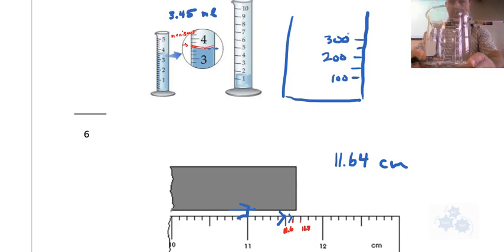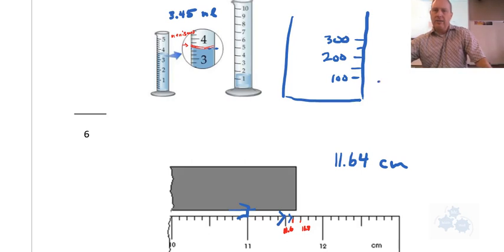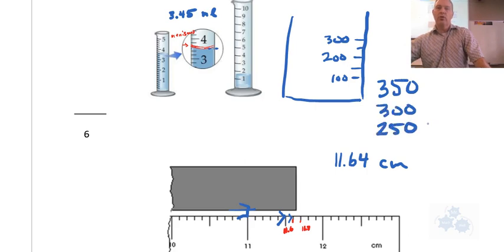So with this one right here, and if you look carefully at this one right here, it's just under 300. So I can only guess, I can guess 350 for sure, or I can guess 300 for sure, or 250 for sure. Anything in between there, I can add one more number. But the uncertain number has to be here, I guess.